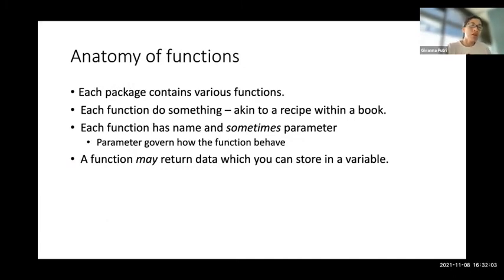In the previous slides, you probably heard me talking a little bit about functions and so forth. Functions are the tools that are within a package. Each package contains various functions, and each function has a name and sometimes parameters. These parameters govern how the function behaves. For instance, if you run a clustering function, it may have a parameter that allows you to specify how many clusters you want to produce.